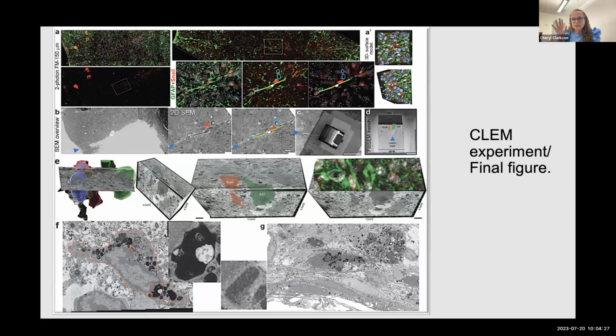Never believe just in an accumulation of cells. That is insane, because when you are doing light microscopy, you are acquiring a gigantic volume. And in the EM level, at the beginning, you are really, really lost. So as you can see here, once I found my region of interest, we did the deposition and milled the trench.